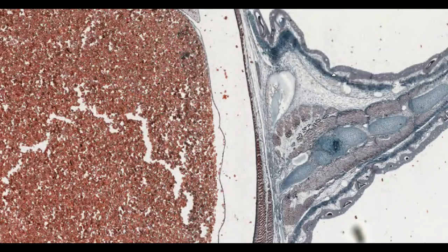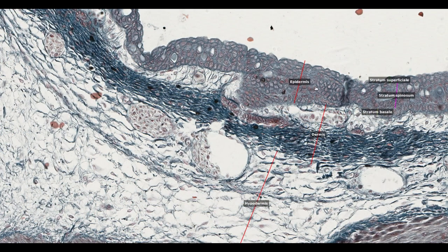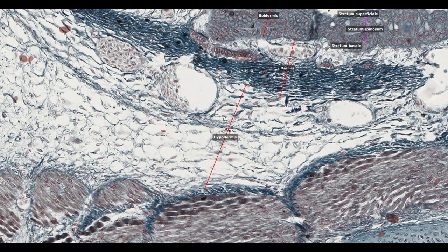This is slide 249. Just as in other vertebrates, the skin of the dogfish can be divided into two regions, the epidermis and the dermis. The epidermis consists of the more superficial layers of cells with the dermis underneath. There is often a layer deep to the dermis called the hypodermis, which is equivalent to the subcutis in mammals.